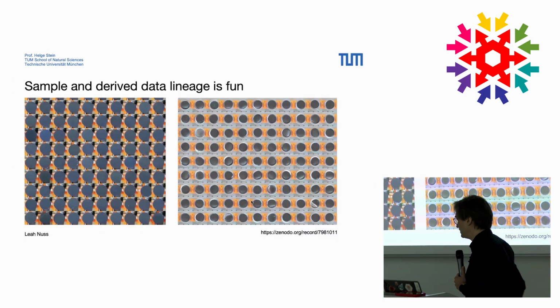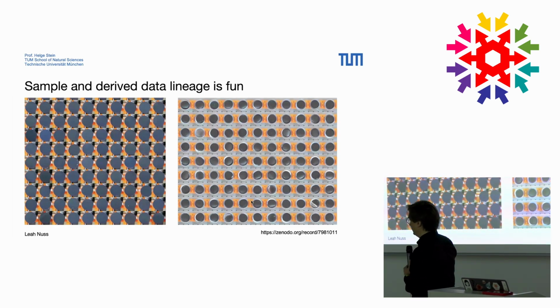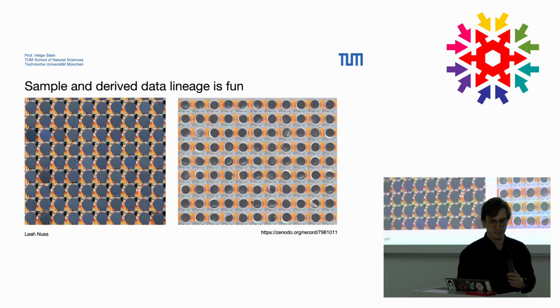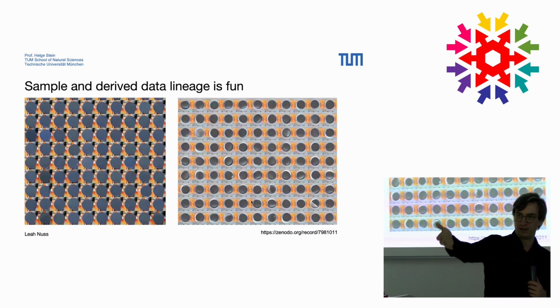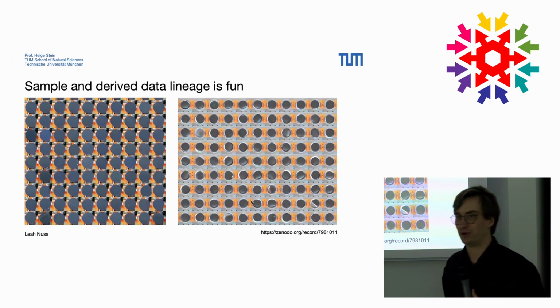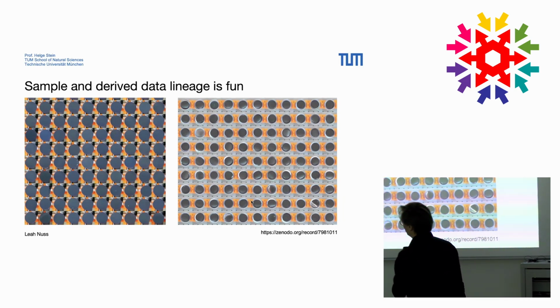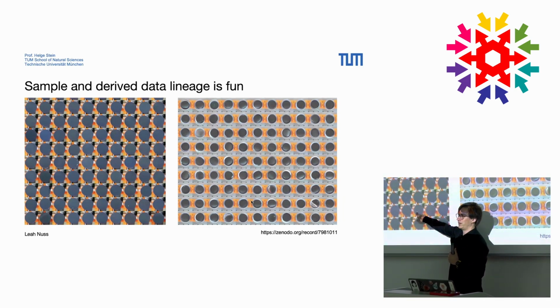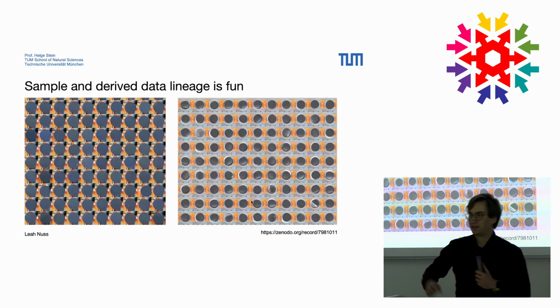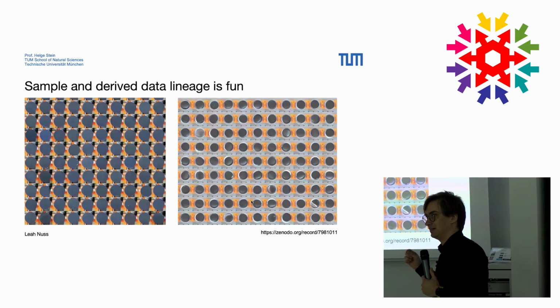So what you get in the end is you get batteries, okay, cool, but you also get not just data lineage, you also get sample lineage. So why is this important? You could probably, the further away you sit, maybe tell that there are some slight variations in the gray tones here. If you sit very, very close, you could maybe even see that there are some cells with spots on them. So this is cool because now we can do something that very few battery researchers that make this by hand can do.